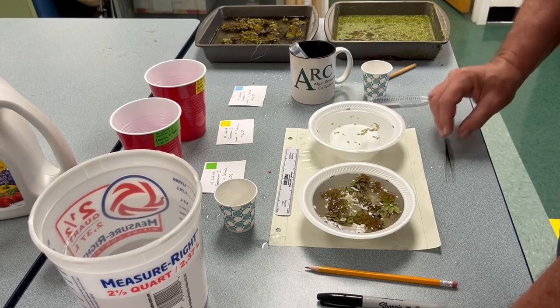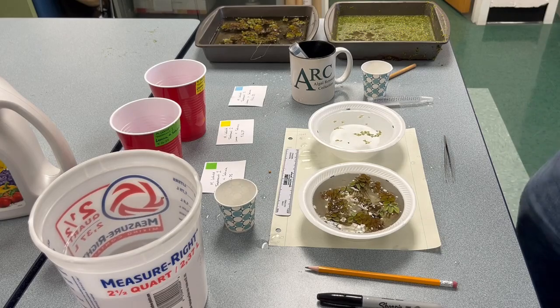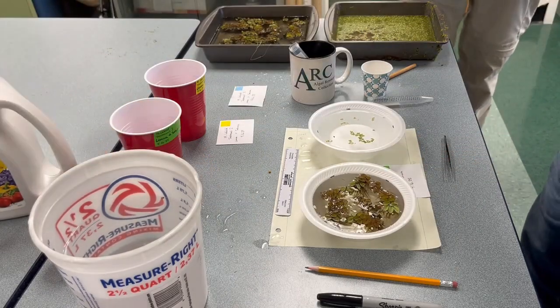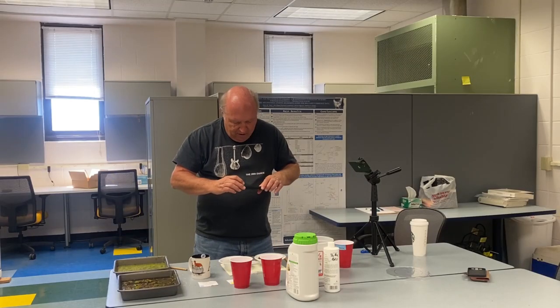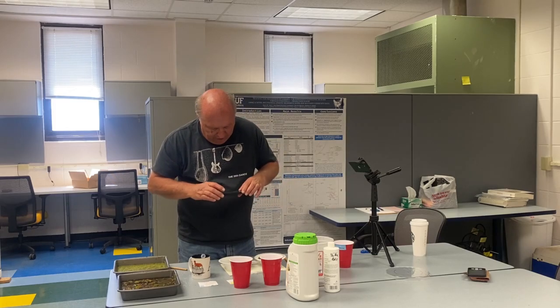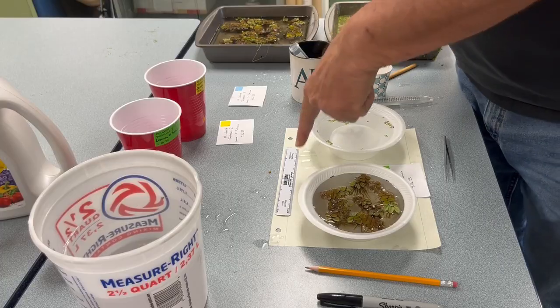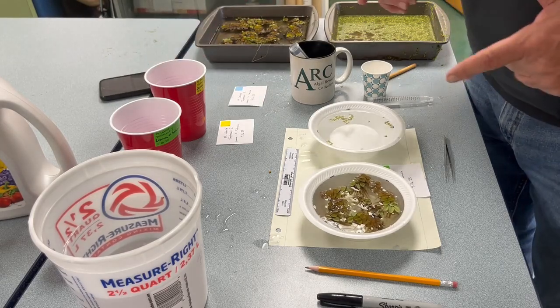Okay, and then we're going to take a photograph of them, and yeah, we put that there. And do we have a camera? And try to find a way so that you don't get glare in the picture. Okay, and you'll notice that there's a ruler there, which we're going to use to calibrate our photos.